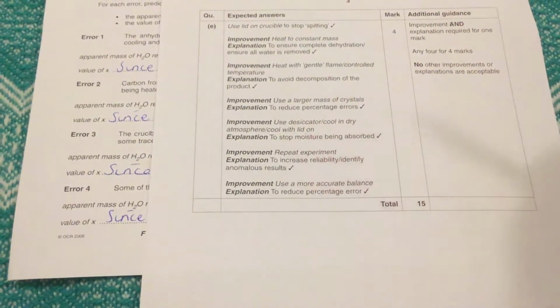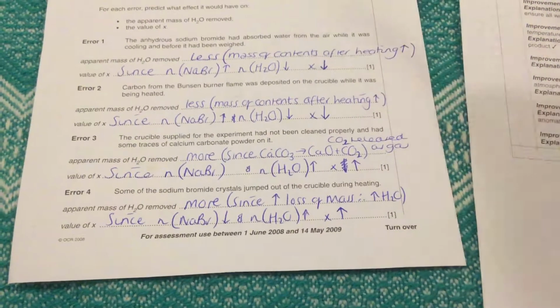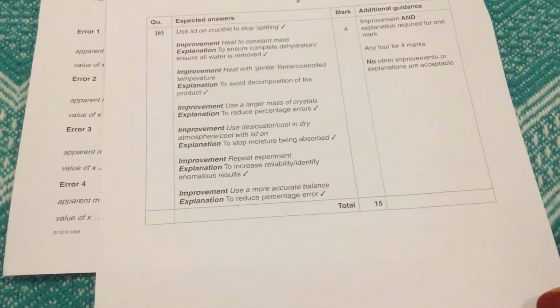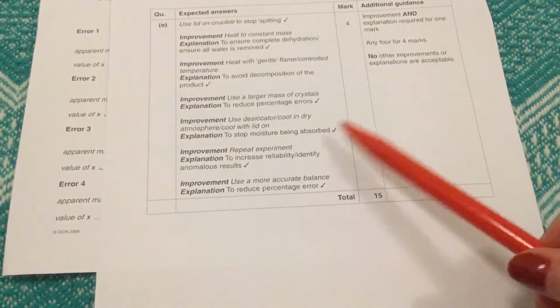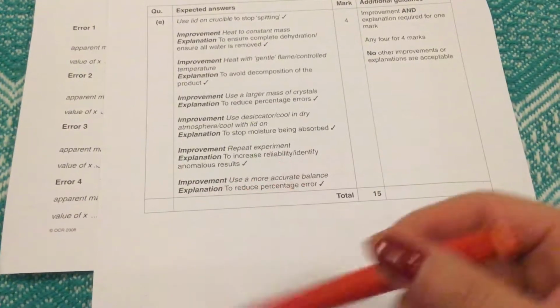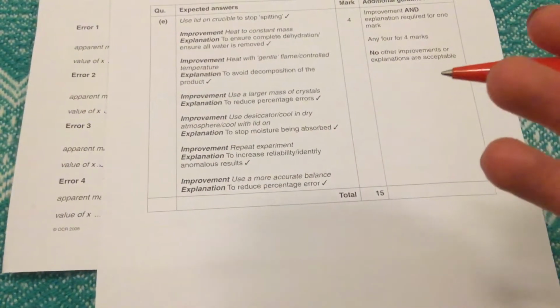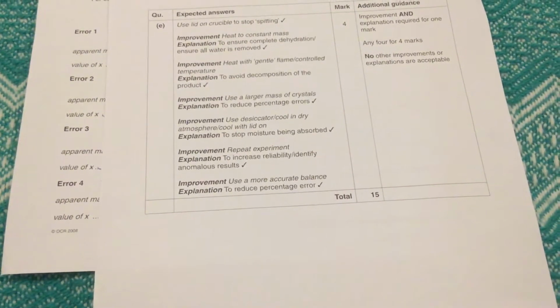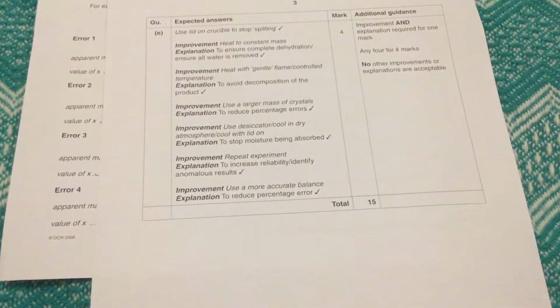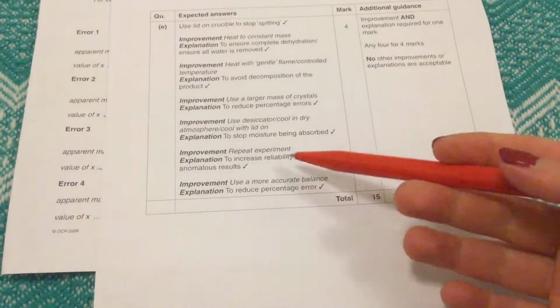Use a desiccator to cool and dry. Now this would be connected to this one here, prevent absorption of water from the atmosphere. So use a desiccator or cool it in a very dry atmosphere. Stop moisture being absorbed. Repeat the experiment is usually quite a vague improvement. It's not always credited with marks in IB and A-level examinations, so it is something that I would restrict using unless it's the only thing that you can think of as an improvement.